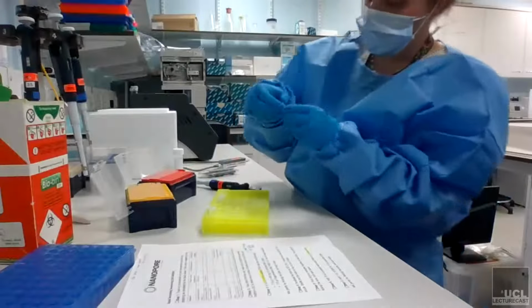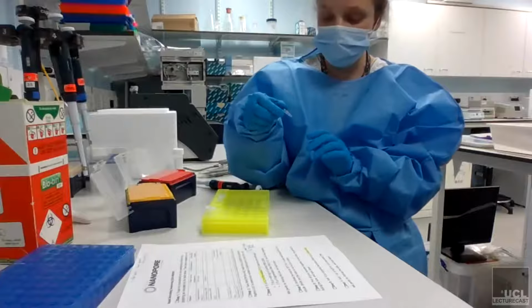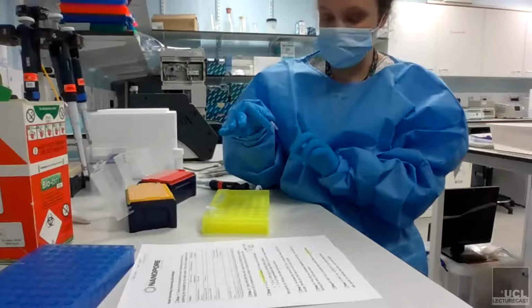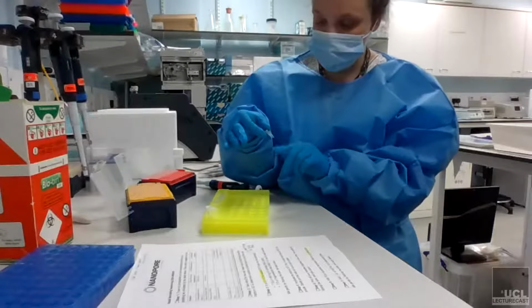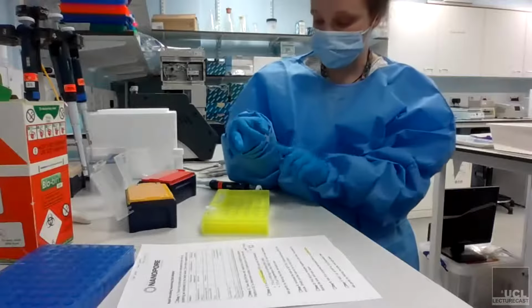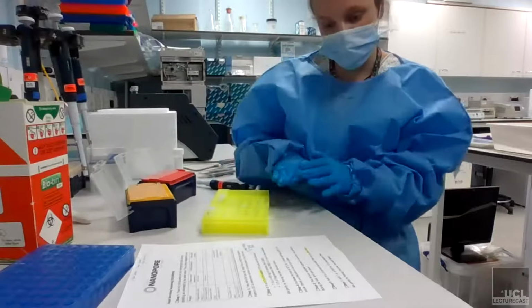Yeah, exactly. So I'm just going to give them a gentle flick. Because you want long strands of DNA, the less aggressive you are with your mixing, the better. Ideally, don't pipette to mix, because you're going to shear the DNA. So be as gentle and loving as you can with your DNA, throughout the whole thing actually, because you ideally want really long strands. So those are my samples all mixed together in a pool.